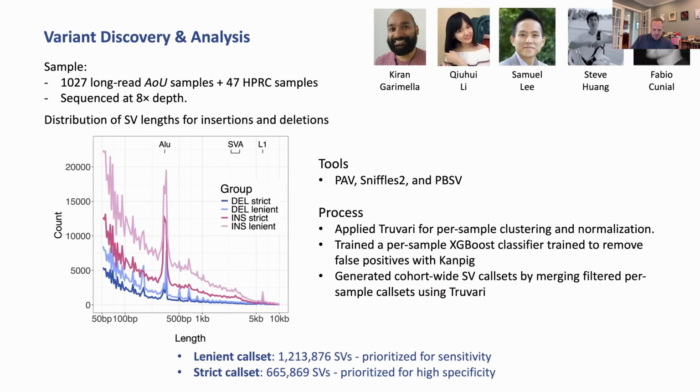So this is a summary of the data and the variant calling that was performed here. So we had about 1,000 people. For practical considerations, when we launched the project, to keep it practically affordable, we were targeting modest sequencing depth here. So this is 8x coverage. I should comment, we did a lot of analysis, both theoretically and also empirically, to ask the question, how successful are we at recall and specificity at 8x coverage. Of course, more would be better coverage, although when we're looking at thousands of samples and then beyond, into tens of thousands of samples and beyond, there is this practical reality.